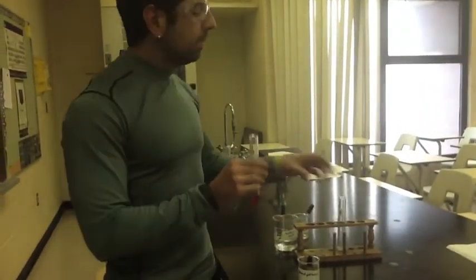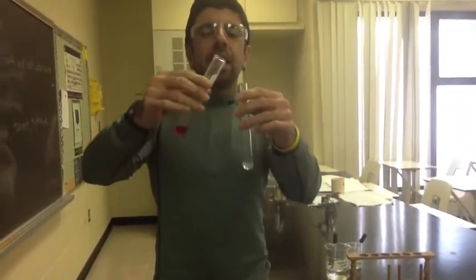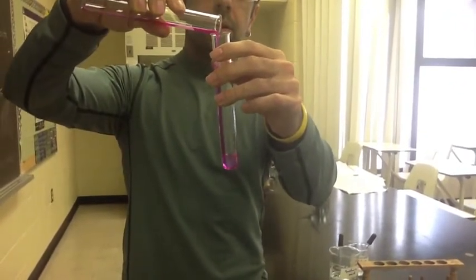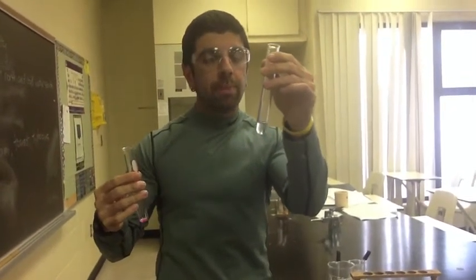Now, one of the things that I really love about the end of this experiment, I always tell students, is pick one or the other and pour one into the other. Choose the base, pour it into the acid, or the acid into the base. Doesn't really matter. I'm actually going to pour the base into the acid and watch this observation. Take a look at what is going to happen. We stir it up and notice we remove the color. So tell me, what kind of reaction has just occurred when I poured both of them out? Write out a balanced chemical equation and tell me, has a reaction taken place, and if so, what is the evidence?